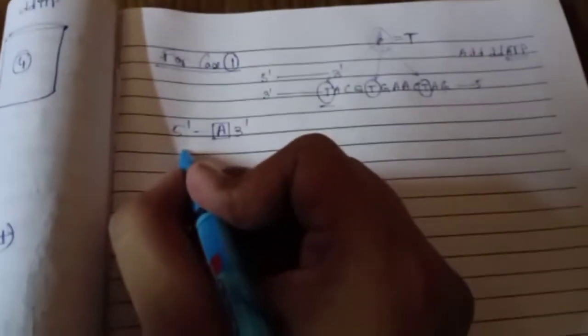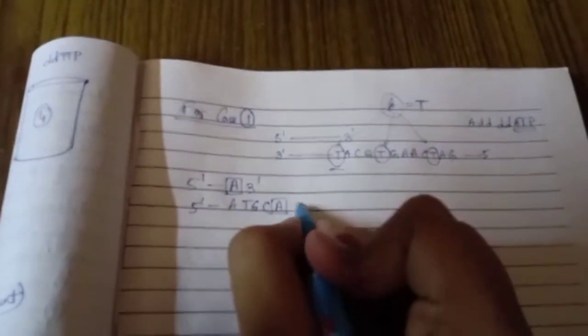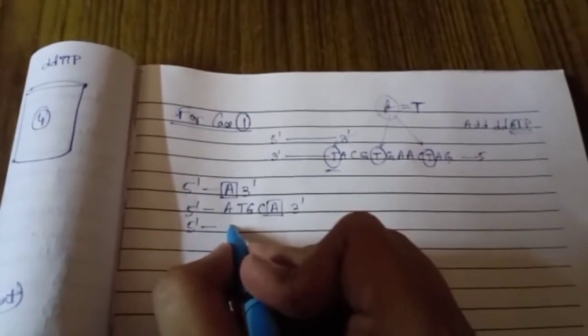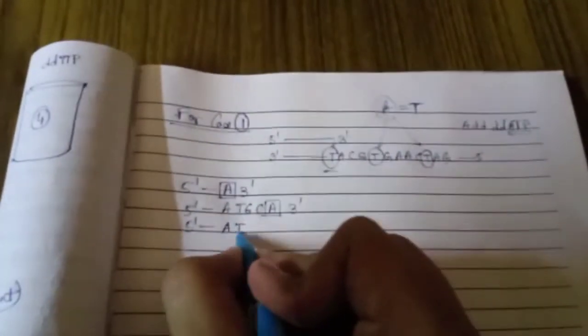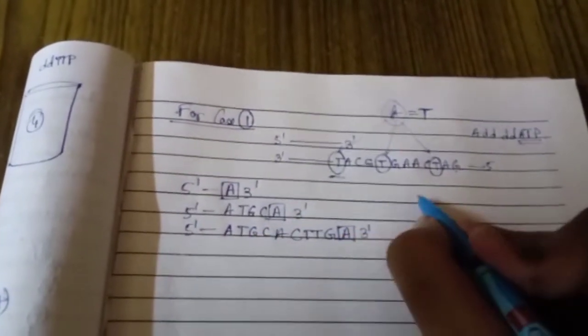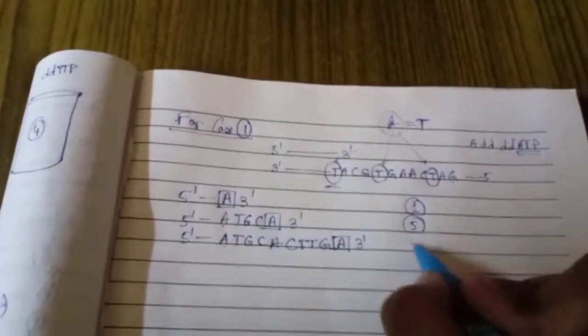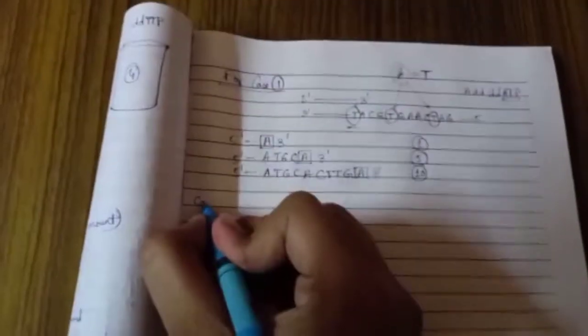Please remember that, and this adenine terminates at the thymine position. So we get 3 fragments from here. One is 5'A, because it terminates at thymine, one is 5'ATGCA, where 5 nucleotides are present, and the next one has 10 nucleotides.